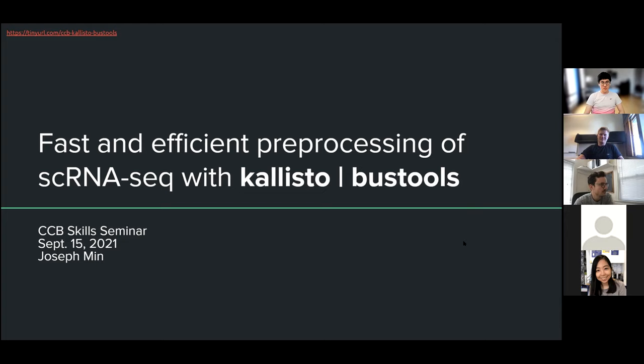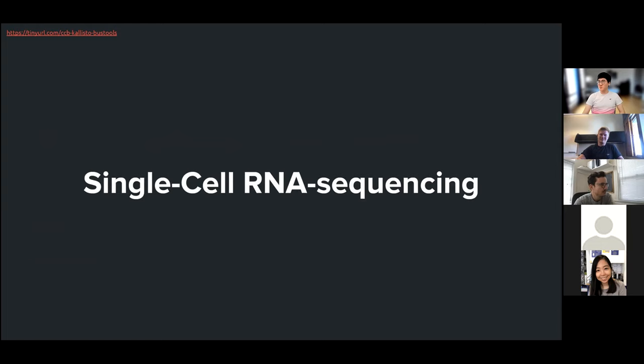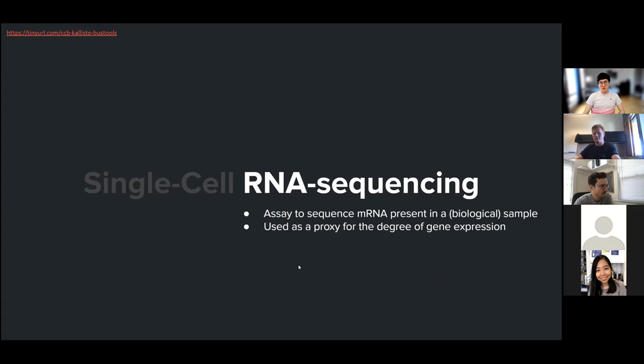So, single-cell RNA sequencing. We've heard this term a lot. It's been the craze for a few years now, and everybody seems to run a single-cell RNA-seq experiment to profile new cells or to do what's called RNA velocity analysis, or many other things as well. I think it's useful to decompose this, to figure out what we actually mean, into two parts. The obvious first decomposition is to see what RNA sequencing is.